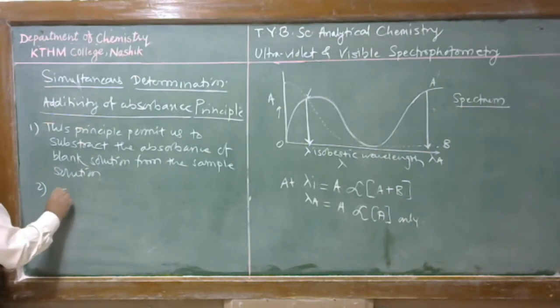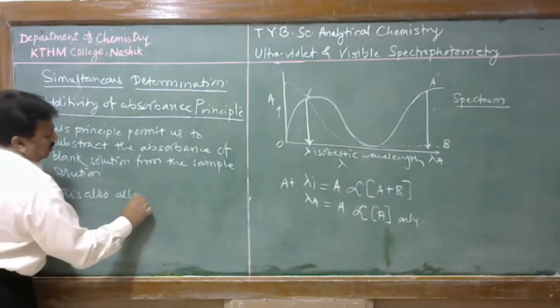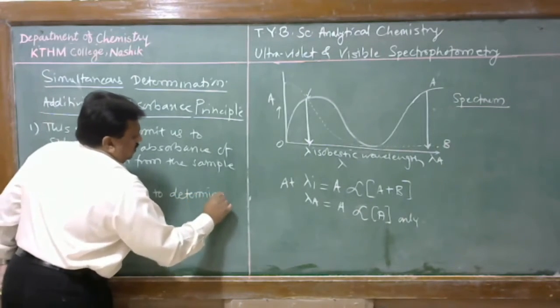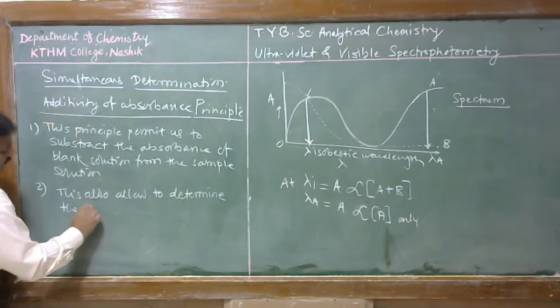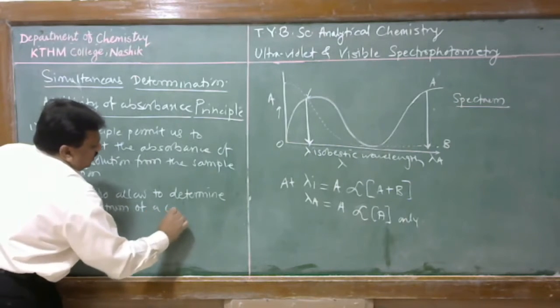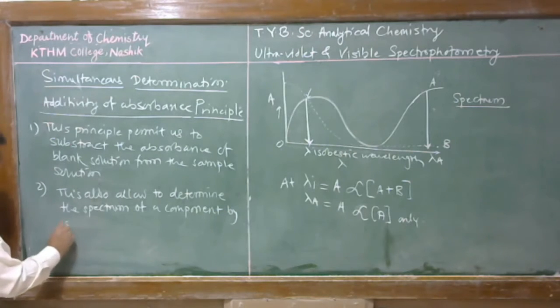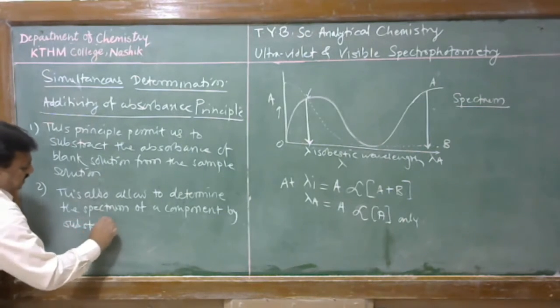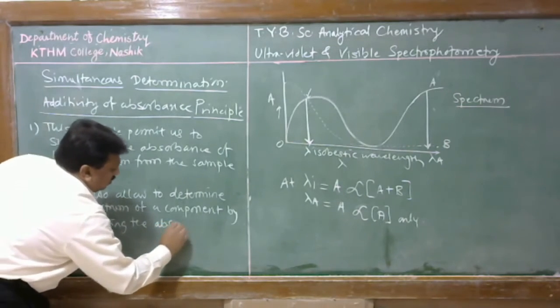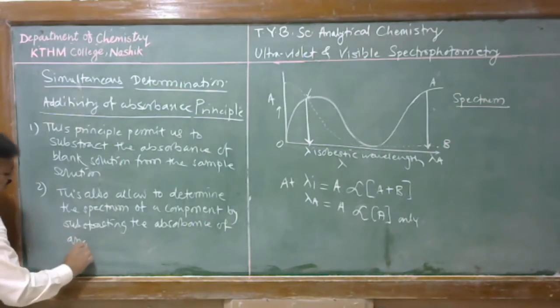Similarly, it also allows us to determine the spectrum of a component by subtracting the absorbance of another component.